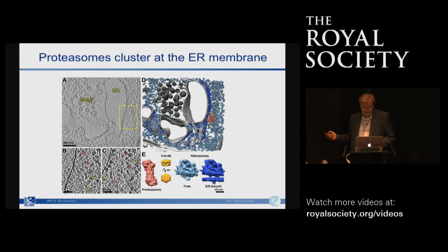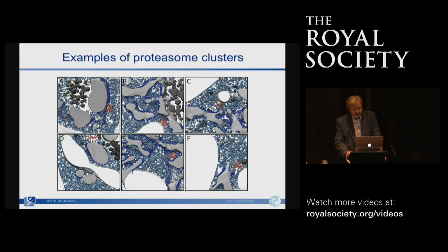And we have, of course, ribosomes free and ER bound. All these clusters have similar features. They have similar size.